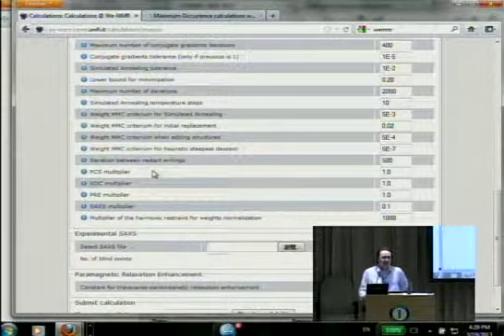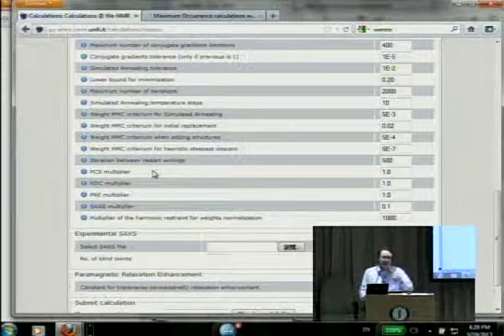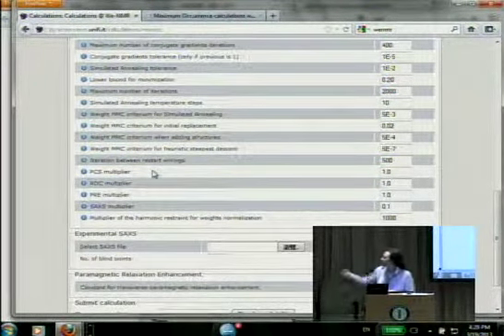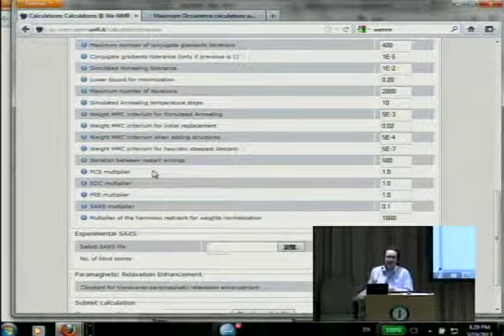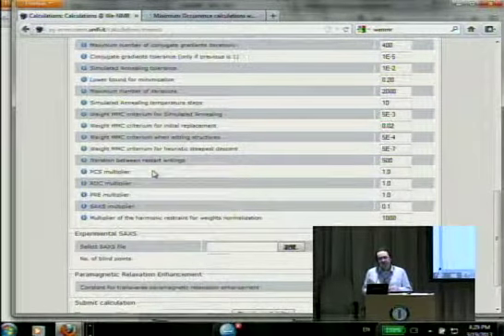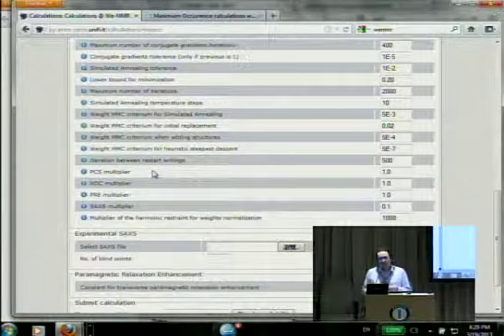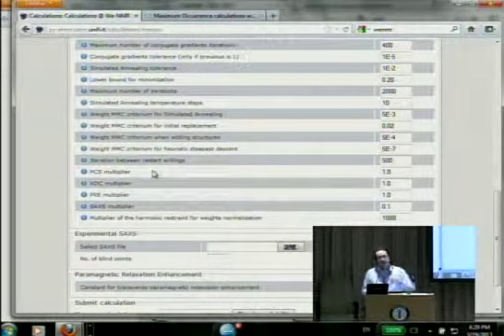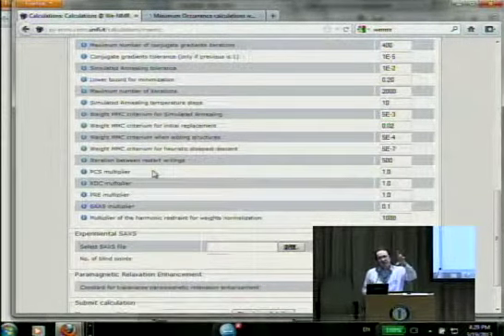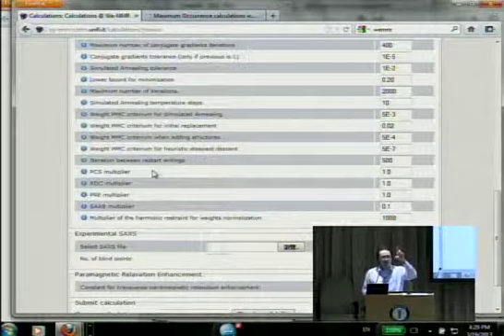I'm curious, if I had multiple resonance, can I put them together? Yeah. You can have multiple. You have to specify. You still upload only one file, but you specify from which metal you are measuring. In the first step, I had the pseudocontacts and the tensor parameters, but you can actually have in the same file multiple lists of pseudocontacts and multiple tensors, and you just need to tell the program, you know, this is 1, this is 2, this is 3.